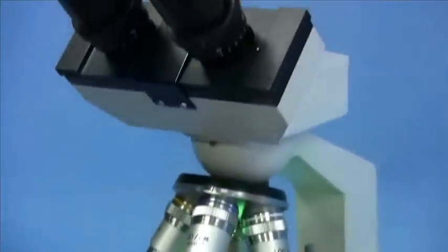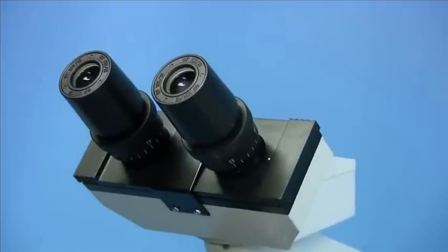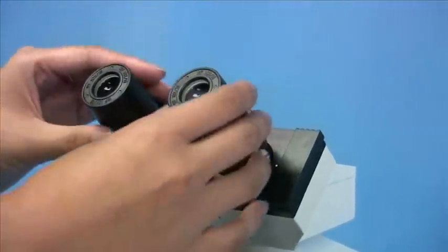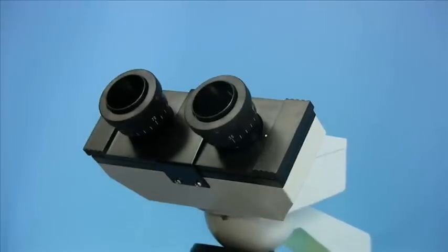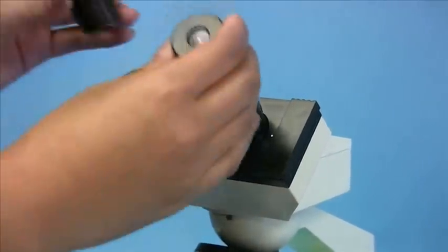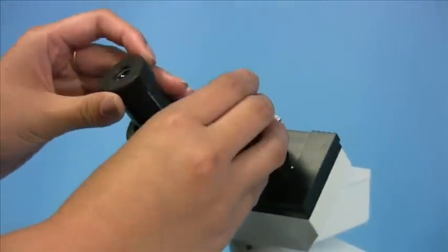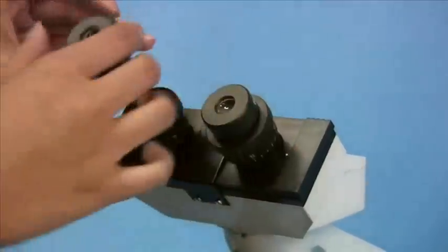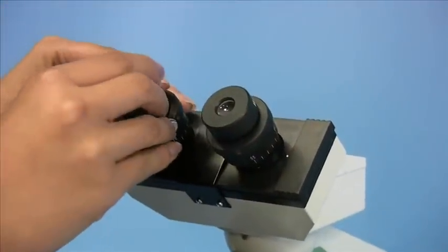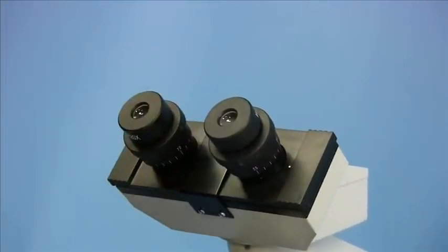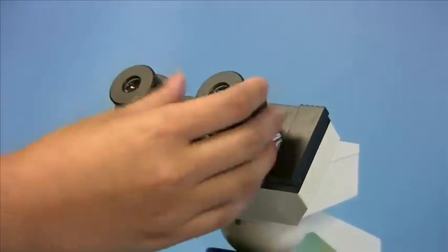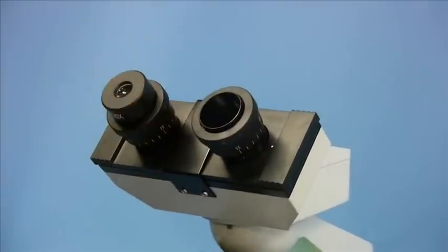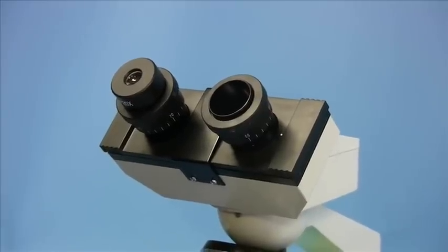Now if you want to use the other pair of eyepieces, simply remove the 10x eyepieces and place the 20x into the eyepiece tube. If you want to use a camera, then simply remove one of the eyepiece and place the camera into the eyepiece tube.